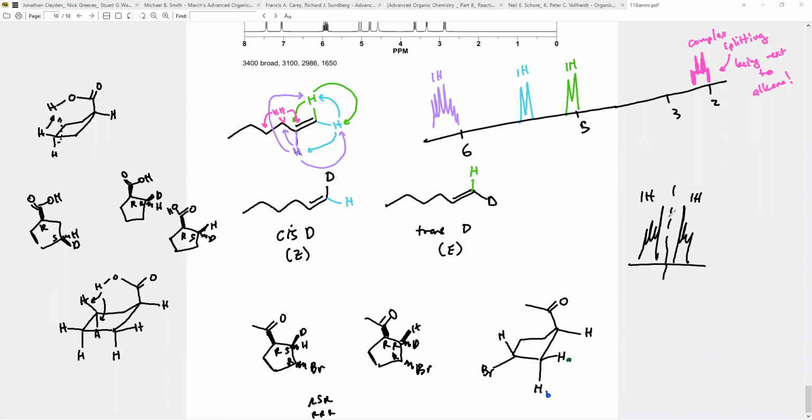But usually, one representation is we have two different 1H peaks for a CH2 than we expect. So we know that there's some sort of diastereotopism happening, right? This would be like for a ring, right? And depending on what it's around, the chemical shift can change.